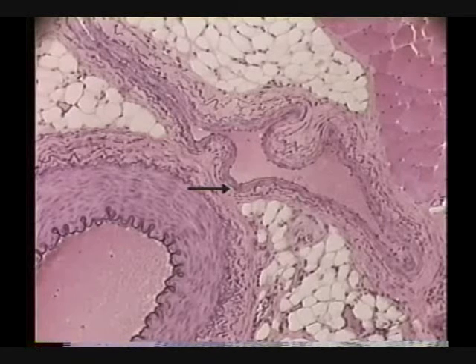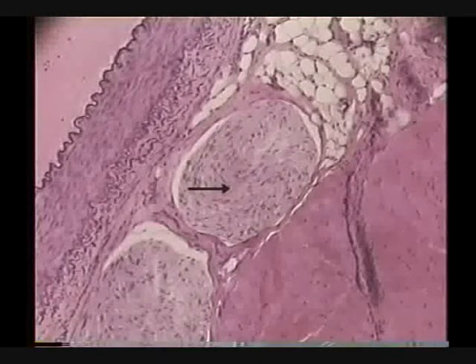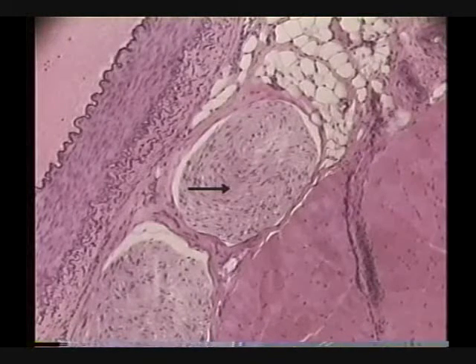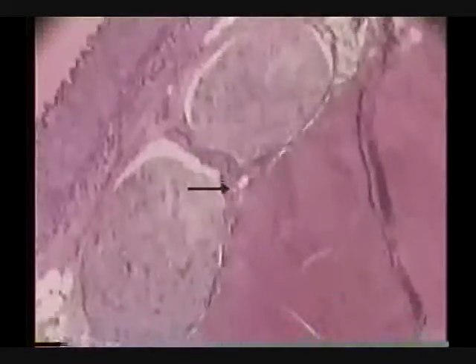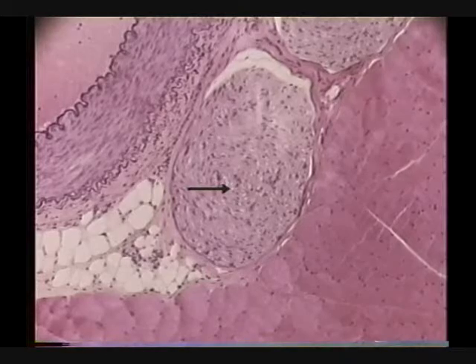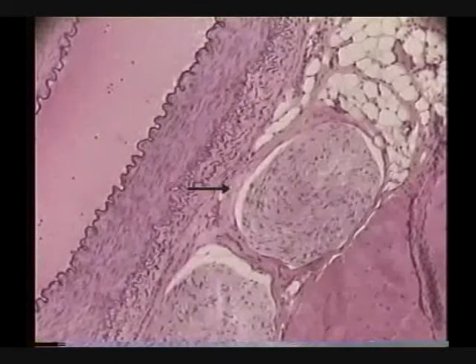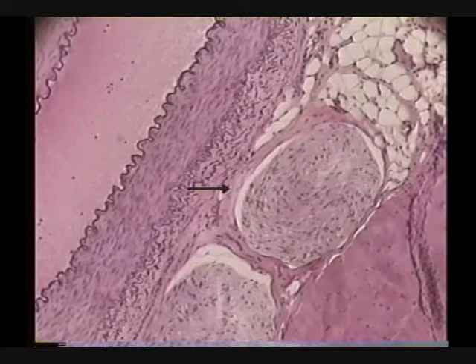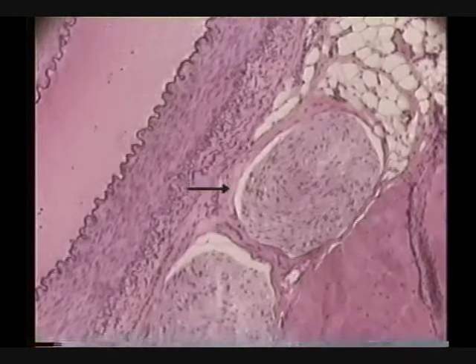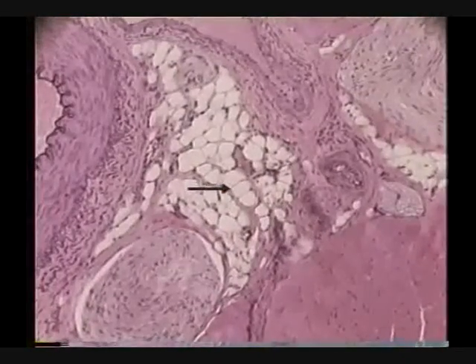On slides like this you see other things - we've seen the skeletal muscle, all the adipose, and these other structures. They tend to travel together, so this is one of those triad things. These structures are nerves - very good shots of nerves with their tunics around them. You remember endoneurium, perineurium, epineurium? We've got those connective tissue layers around them.